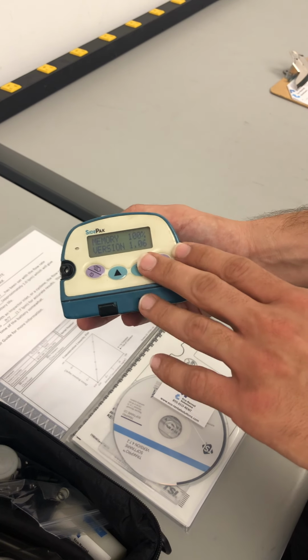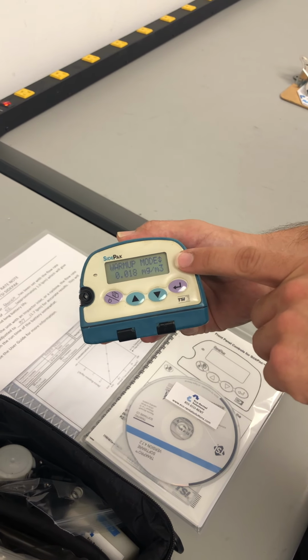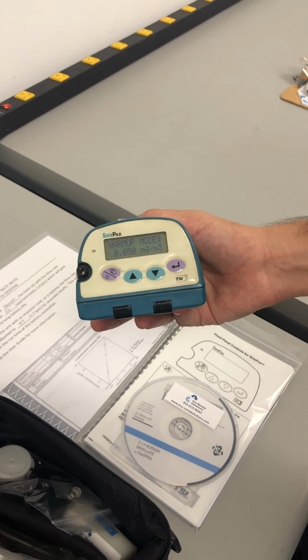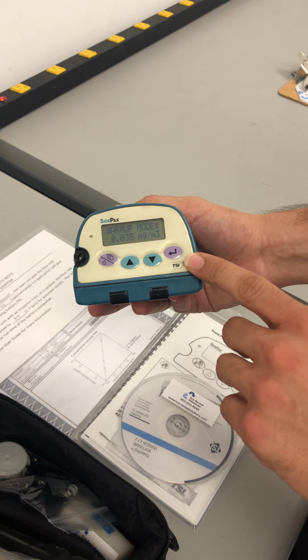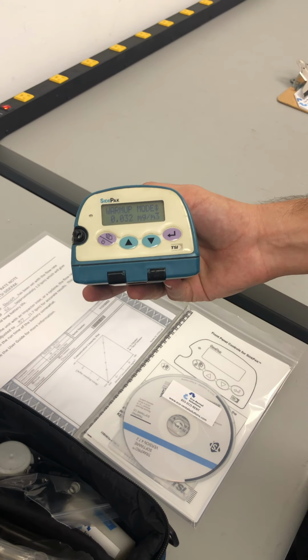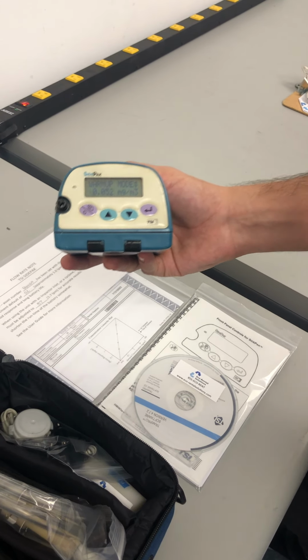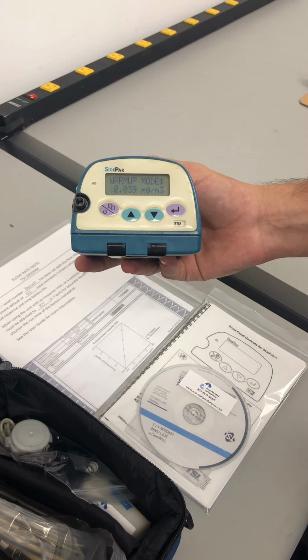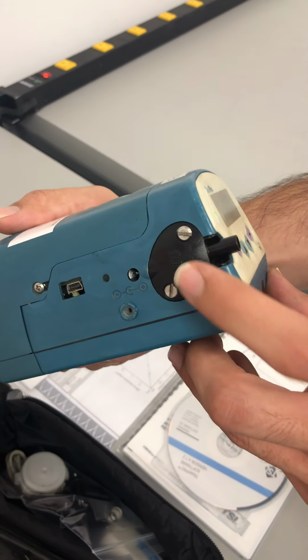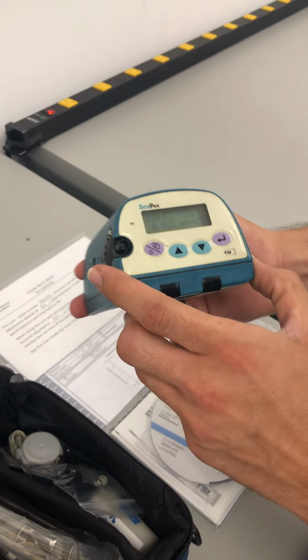It'll briefly go through a couple menus and then go through a small warm-up mode, which should take maybe 15 to 30 seconds, if that. And then you'll go into your survey mode. And survey mode is pretty much where you're going to be getting all your data for that PM10, because it's just going to be giving you real-time aerosol concentrations. We've already put the PM10 impactor in the inlet slot, so you don't have to worry about that.